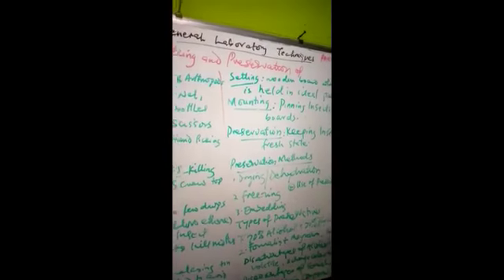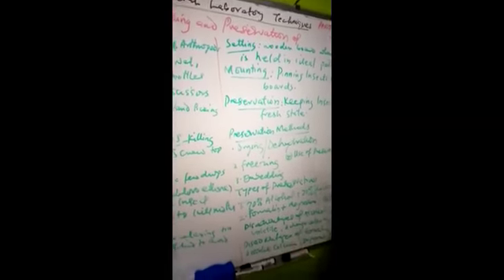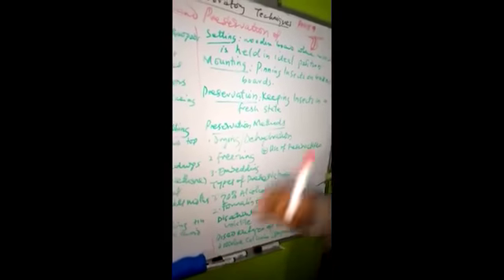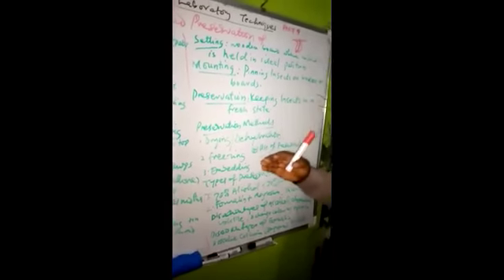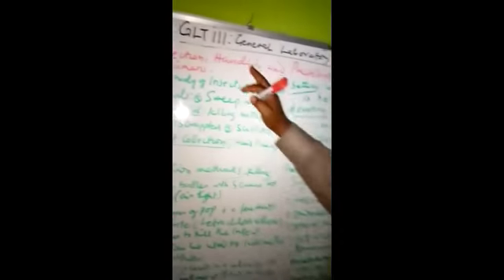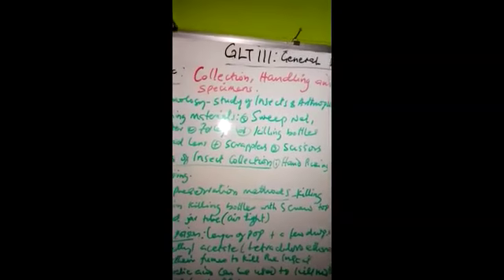Then we have traps generally. All those people who hunt grass cutter and guinea fowl in the villages use different types of traps to collect larger animals other than insects. These are the basic methods for collecting, handling, and preserving specimens. In our next lecture, we'll go into other aspects of preservation.